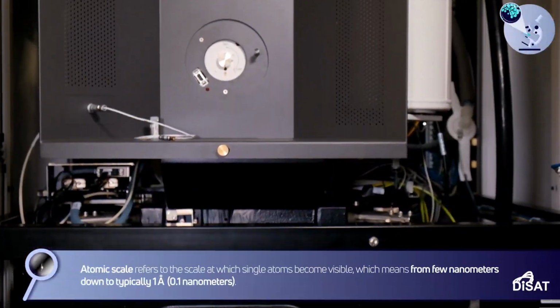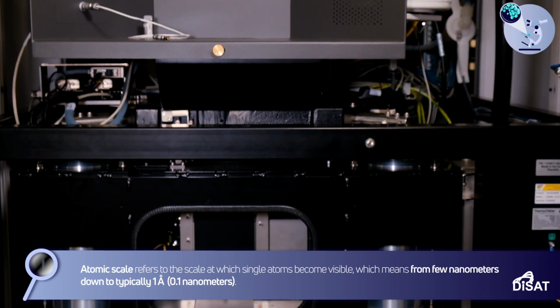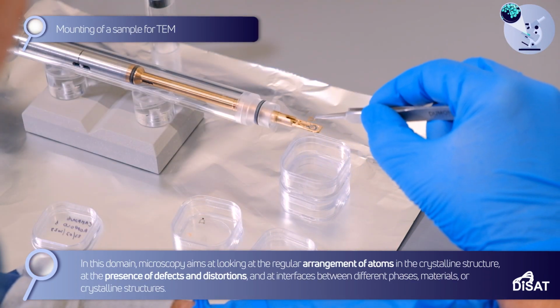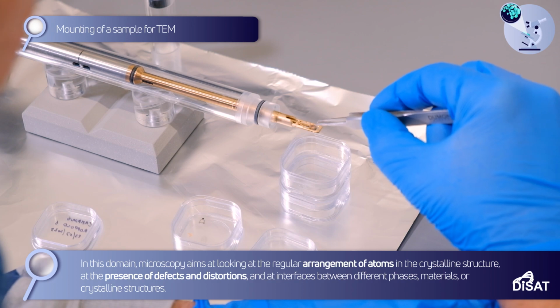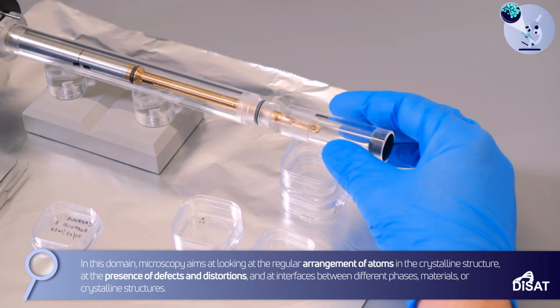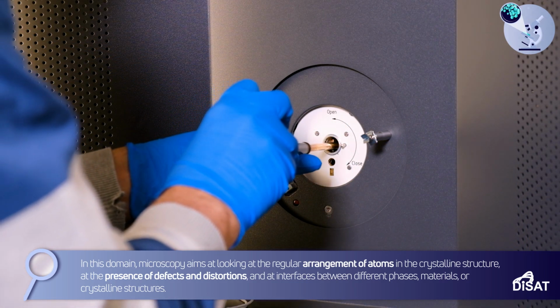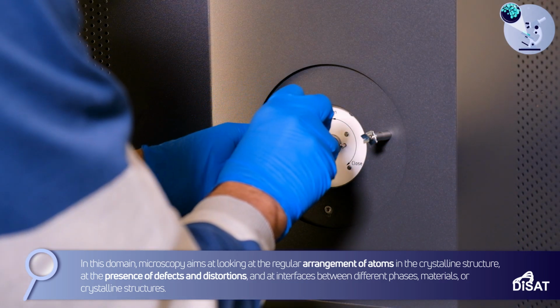Atomic scale refers to the scale at which single atoms become visible, which means from few nanometers down to typically 0.1 nanometers. In this domain, microscopy aims at looking at the regular arrangement of atoms in the crystalline structure, at the presence of defects and distortions, and at interfaces between different phases, materials, or crystalline structures.